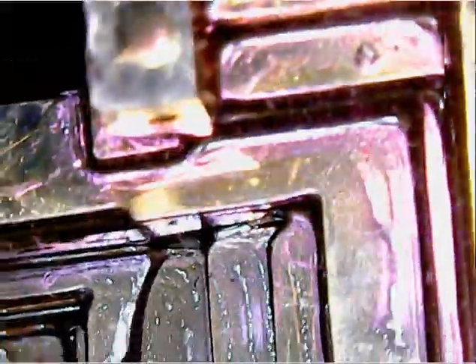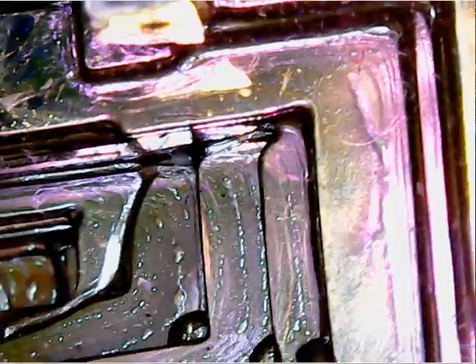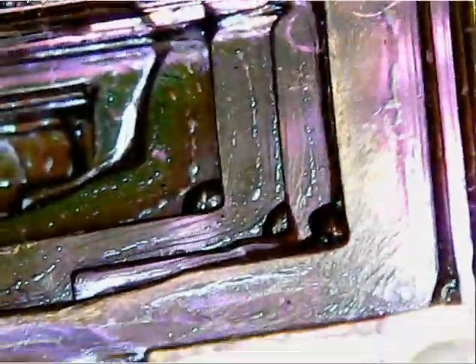You can see all the different colors, you can see bubbles from when it was being formed. See all that? Now flip it over again. We have this side which is an entirely different color.